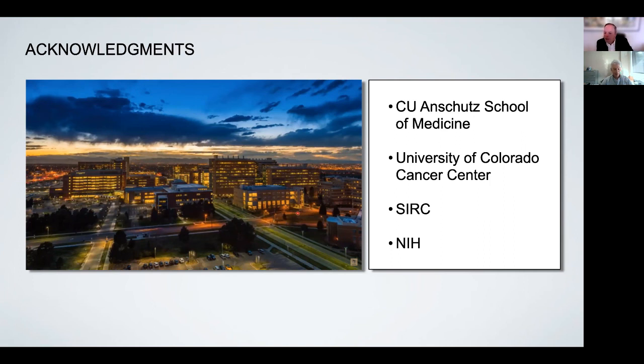I understand. We have sort of the same thing. The data analysis is so labor intensive that it's sort of a last resort that we do it for. And I think also that when it comes to data analysis, the investigator often needs to have a better understanding of exactly how their data was produced and analyzed, and it's beneficial for them to do it if they can. I absolutely agree with you. I think input from the person that is interested in the protein, that knows about the biochemistry and function, is essential. So you put it perfectly. It's really two things, right? Lack of resources, and also the fact that the most likely optimal outcome requires the person that knows the biochemistry and function to be hands-on during that process.